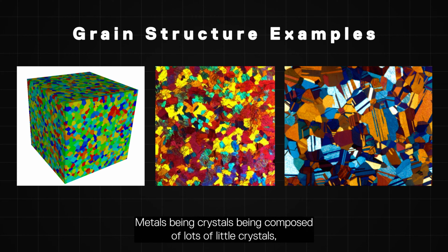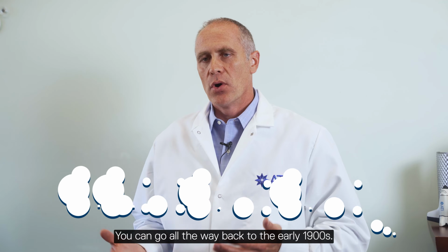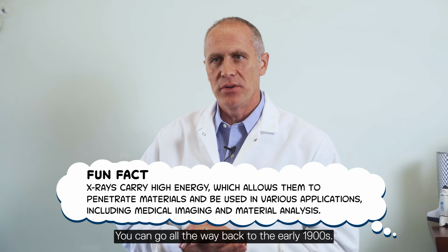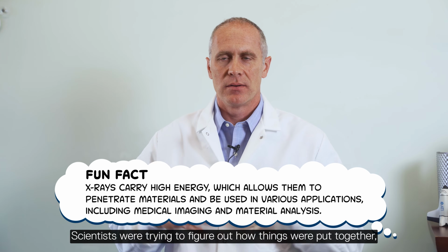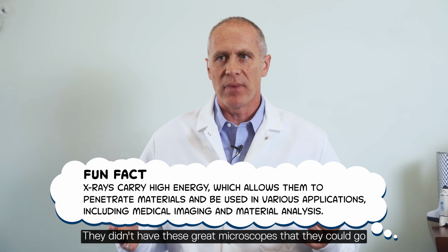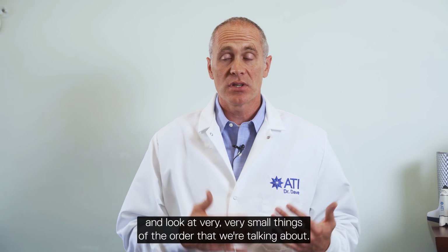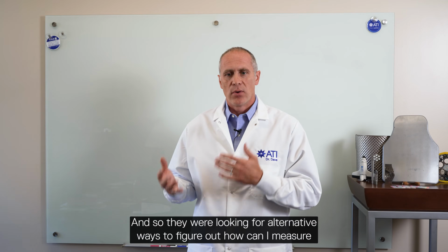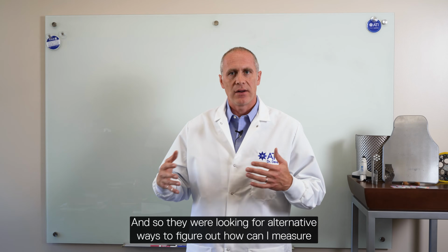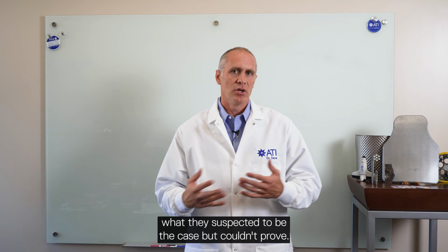Metals being composed of lots of little crystals, how do we know what the structure and the arrangement of those atoms are? You can go all the way back to the early 1900s. Scientists were trying to figure out how materials were put together. They didn't have these great microscopes that they could look at very, very small things of the order that we're talking about. And so they were looking for alternative ways to measure what they suspected to be the case but couldn't prove.